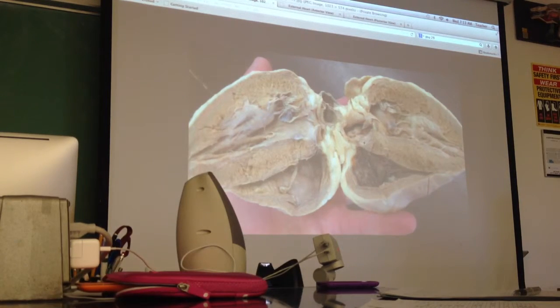You have another one here, that'd be the second one. And then the third one is actually over here. So remember, it's kind of like a clamshell, so if you shut it, this would be right here. That'd be the third one. So if you don't cut it as far open, you'll be able to see all three of those in a ring around this upper portion of the heart, okay? This is where they are. I'm showing them so that you have a better idea of where to look for them. This is not what I would consider a testable semilunar valve. For two reasons, it's broken like that, and I would want to see it a little more associated with the vessel that it's attached to.